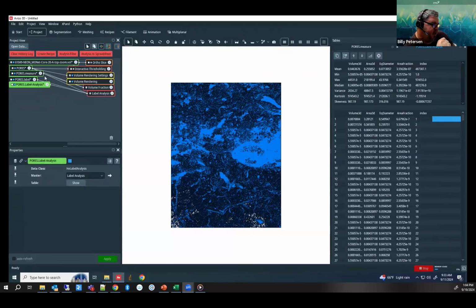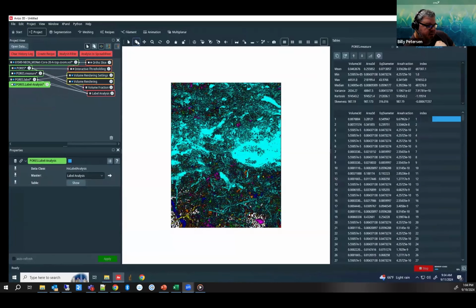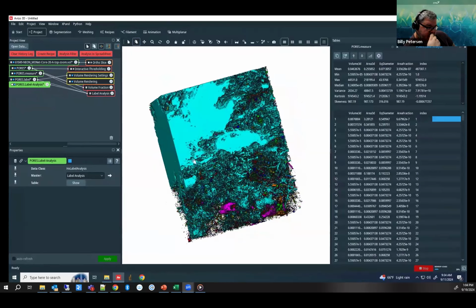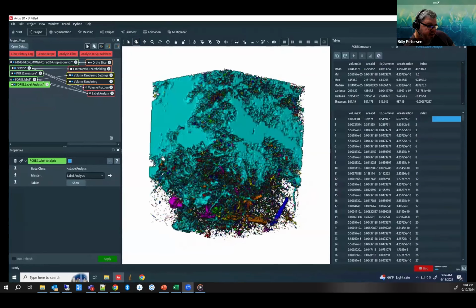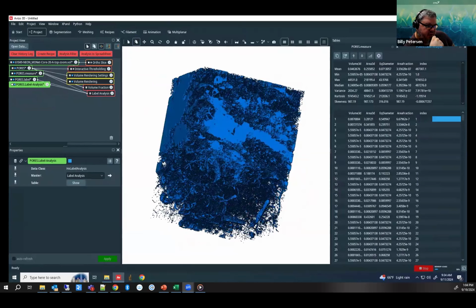This is where we scan it for connected axes. Oh, here we go. This is a visualization of what it classifies as a pore in this case. So you've got that big clump right there, and then everything else that you see down there is generally its own thing.